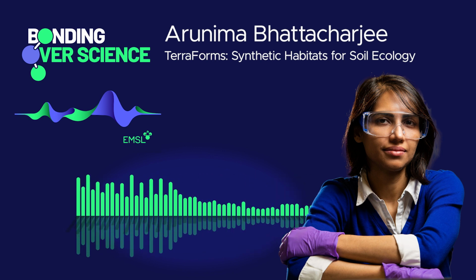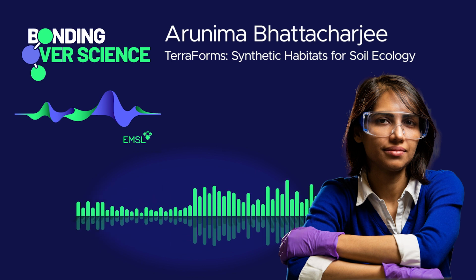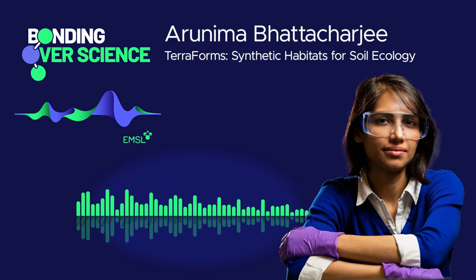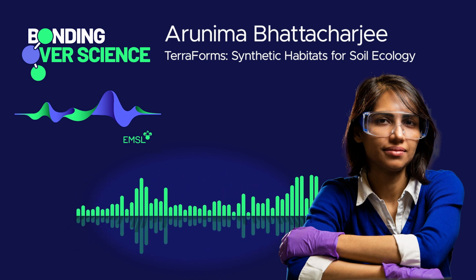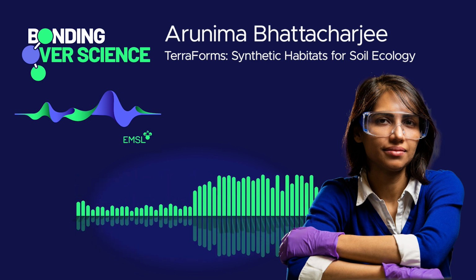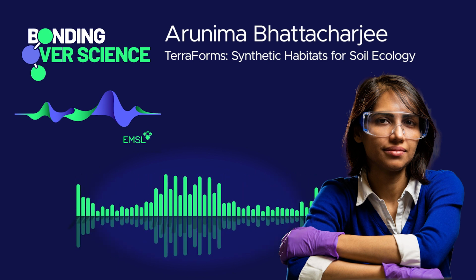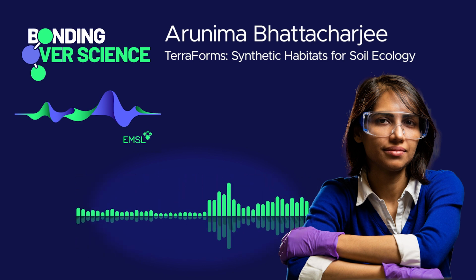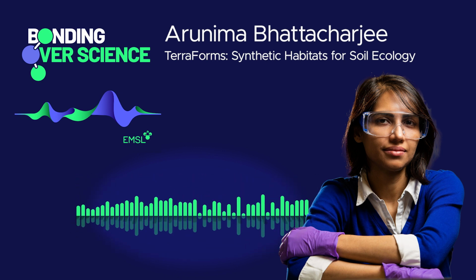First, there is the process of fabrication itself, which we do in the EMSL clean room. The first thing is to fabricate these devices. It is a process called photolithography, through which we create these chips. And we use different materials. We can use PDMS, cover these with membranes, which are compatible with mass spectrometry. We also use different types of epoxies, which are compatible with mass spectrometry. And it depends on what the user wants or what the project requires.